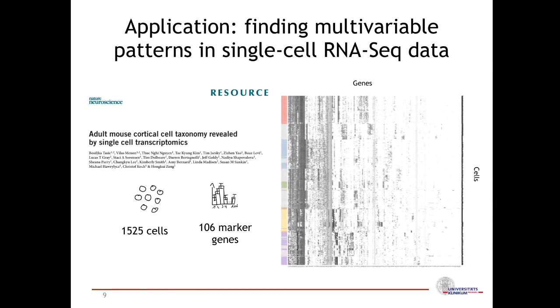Then we want to see now that there are different patterns observed in the genes. So we not only want a good transformation, but we also want to check which genes are actually representing the essential structure in the data. So which genes make up this clustering in these two principal dimensions. And so I would now like to present an approach to infer these genes, or these patterns in genes, which can discriminate different cells. And how do we do it?